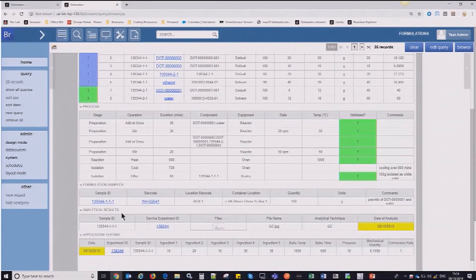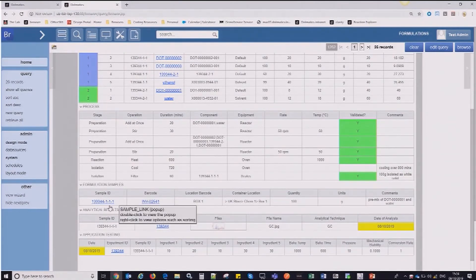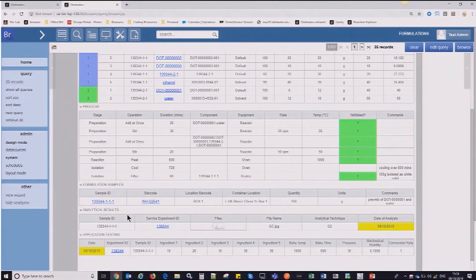Moving on to the sample-centric view here, I can see what samples I've got of that formulation. The formulation may evolve over time, so you might have a sample taken earlier in the evolutionary stage of that formulation, and these can all be captured here as well.